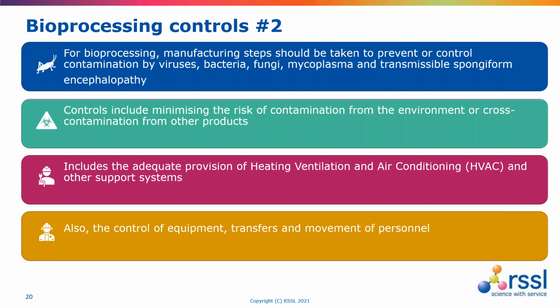And it's important to place a suitable emphasis upon minimizing the risk of contamination from the environment or cross-contamination from other products, and also to consider the operation and design features of the area where purification is taking place, to ensure that we've got an adequate HVAC system, heating, ventilation, air conditioning, and have risk assessments for the transfer of intermediates and other substances, and also to expand that to include equipment and personnel.